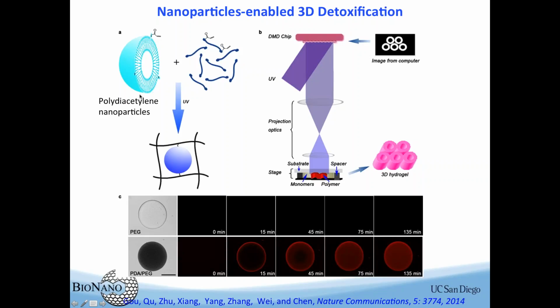Okay, and these nanoparticles actually can sense and trap toxic molecules in the solution. But anyway, we print them in a gel. So this gel is like a sponge. It has these nanoparticles inside the gel because they're embedded when you cross-link them. Okay, and we did a simple test for this polyethylene glycol-based hydrogel device. In this case, there are no nanoparticles. Then you immerse this device into a toxic-molecule-containing solution, and nothing changed over time.